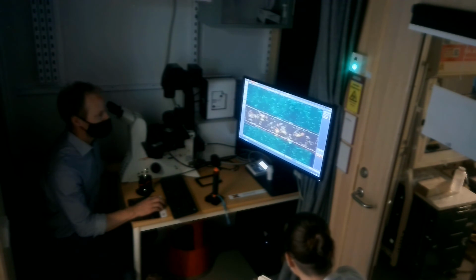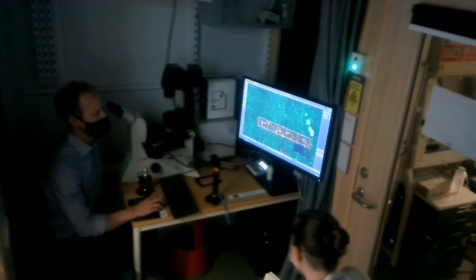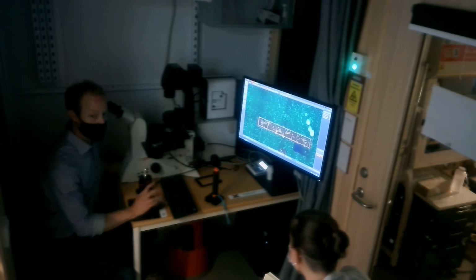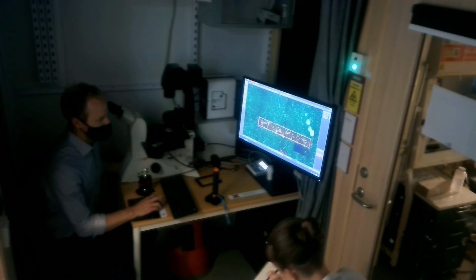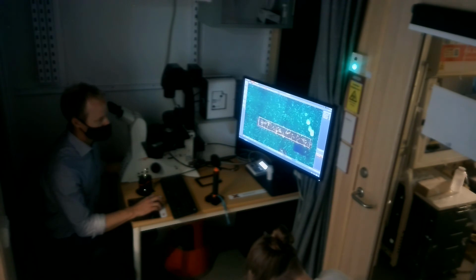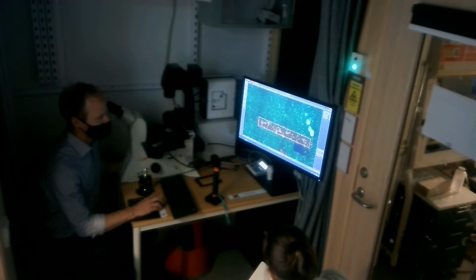So the way to adjust for this, if you have a sample like this, is to use what is called a focus map. So I can put focus points here. So we have the next focus map point. It's the blue little cross here. Hover, focus map point. I pick that. And I will put one point here. And we'll put one point here.